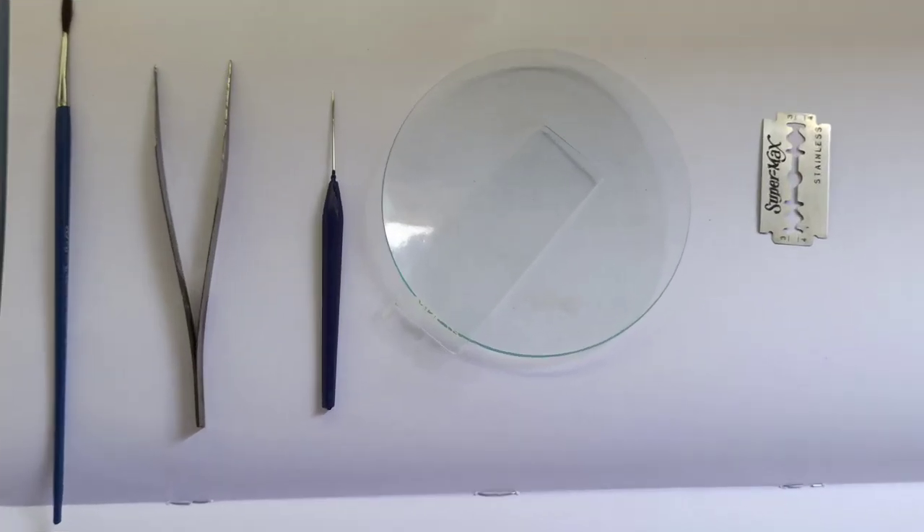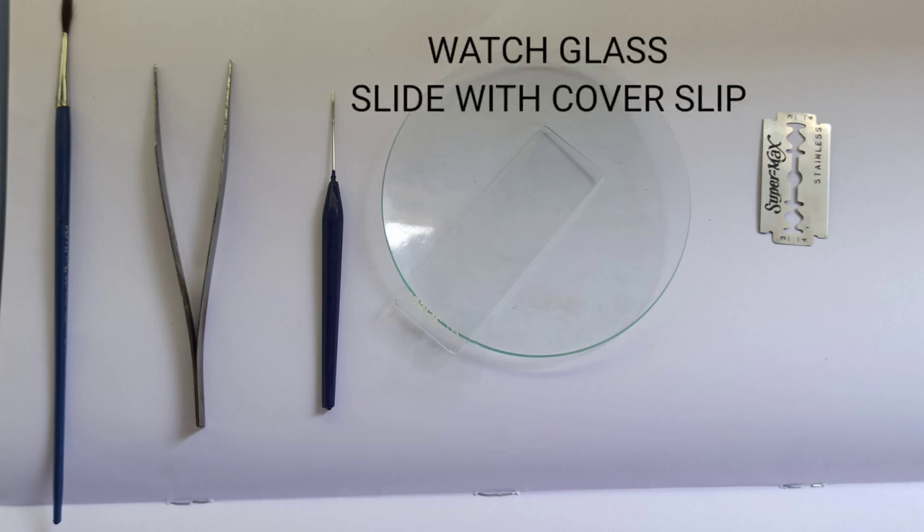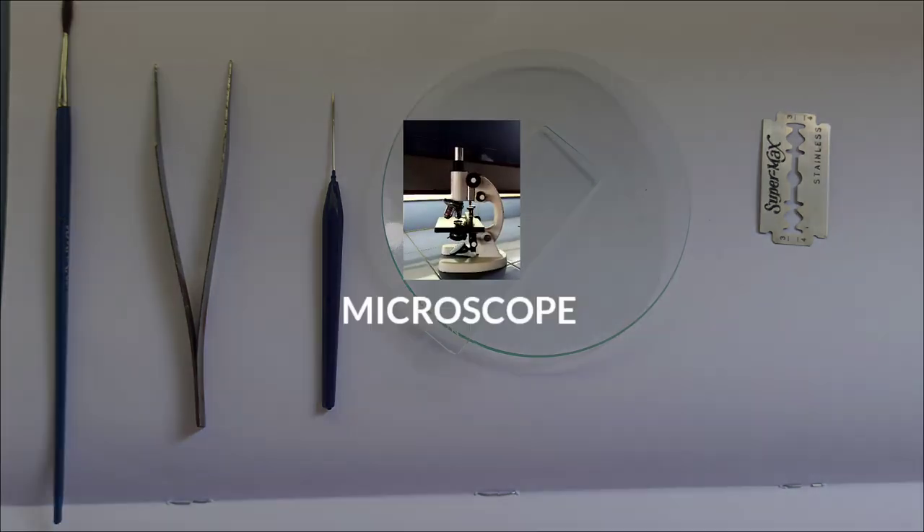Requirements needed to perform this experiment are brush, forceps, needle, watch glass, slide with cover slips, sharp blade, and a microscope.